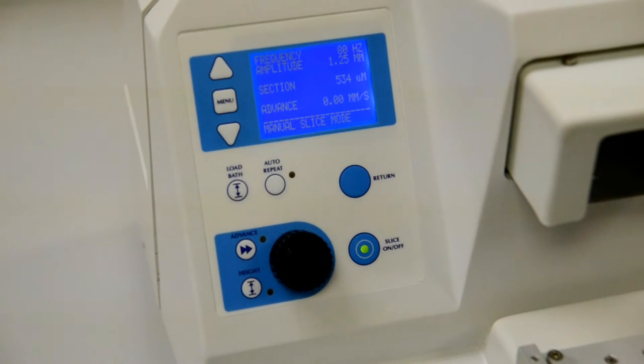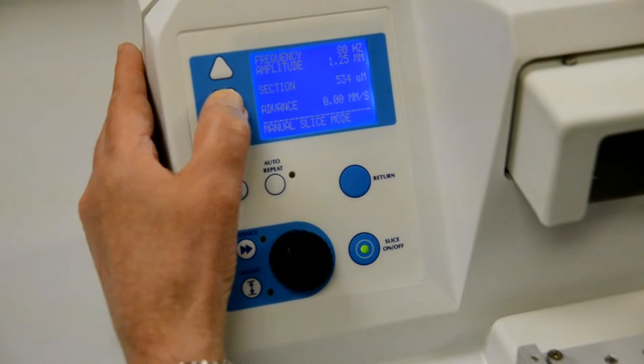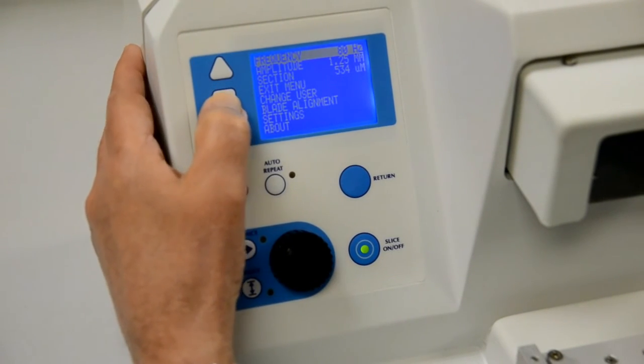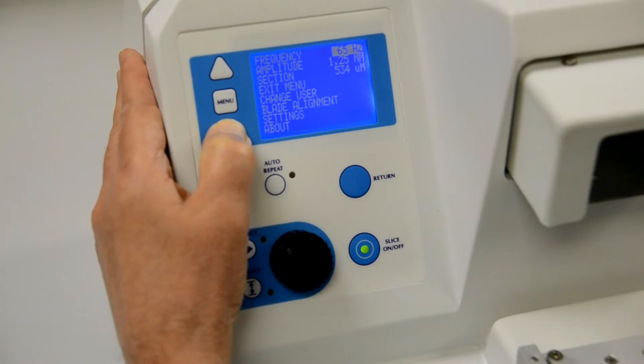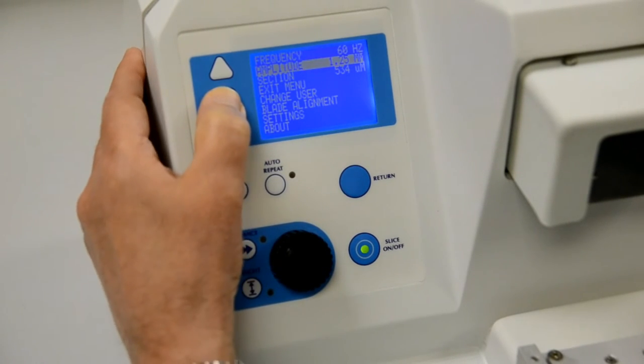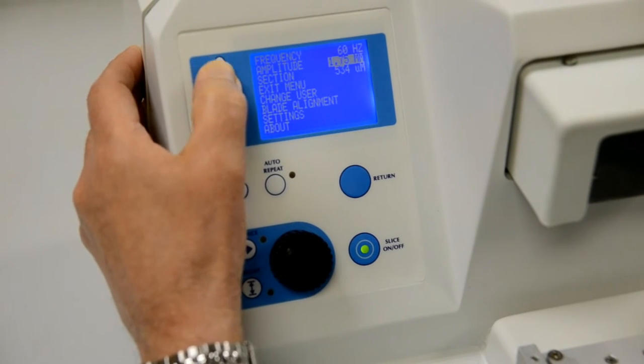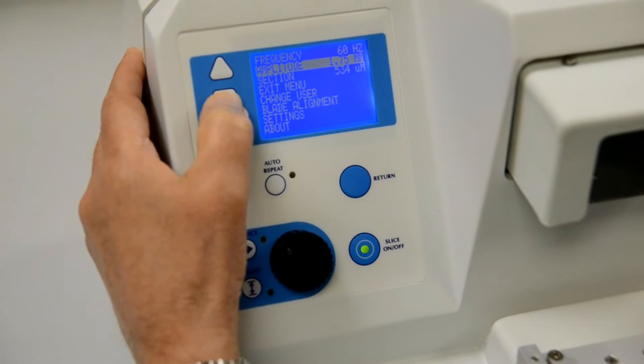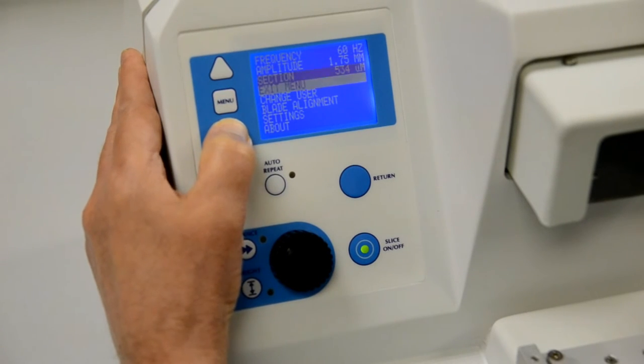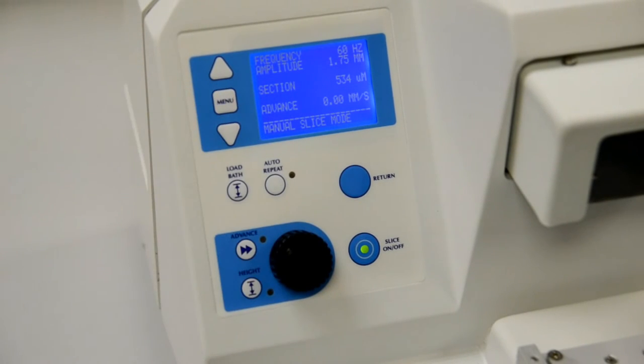Different tissue types and states require specific operating parameters such as vibration frequency, amplitude, and advance speed. Changing the frequency, amplitude, and section thickness parameters is a simple task and is accomplished with a minimal number of keystrokes. From the normal operating screen press the menu key and use the up-down arrow keys to scroll to the parameter that you want to change. Press the menu key again and then use the arrow keys to change the parameter. When you have finished, confirm your change by pressing the menu key again.